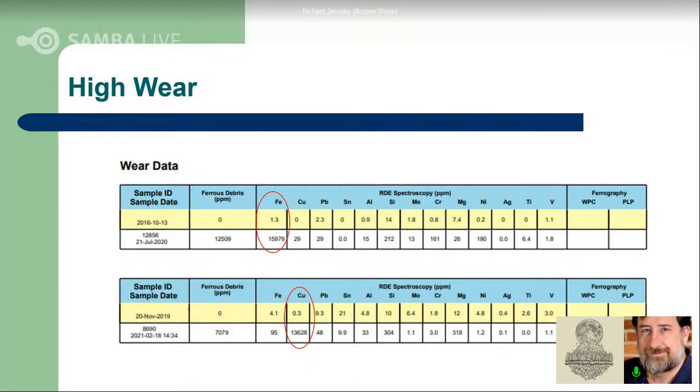And of course, we've talked about this in some of our earlier presentations. There's a number of products out there that allow you to do this, but in doing so, if you have information both about ferrous density and this elemental iron, it looks at different aspects of what's going on. For example, we could have a wear mode that is primarily rubbing in nature. It might be adhesive wear or abrasive wear, and it produces large unoxidized particles.